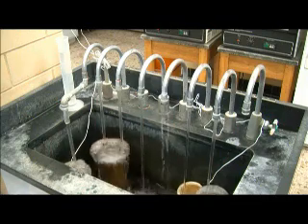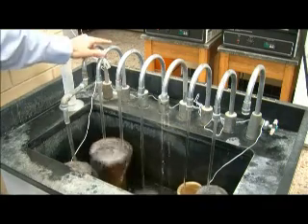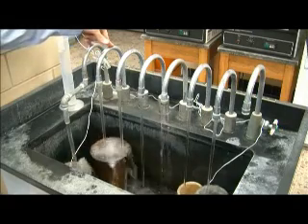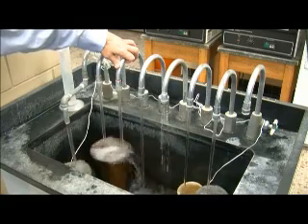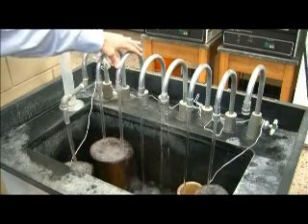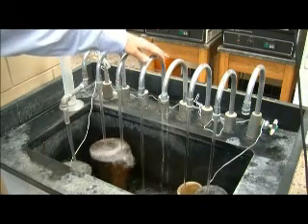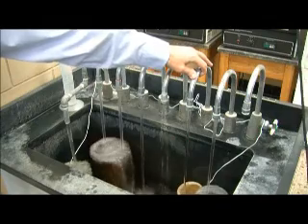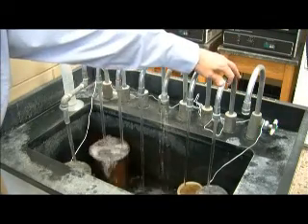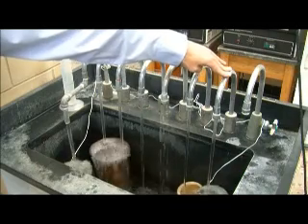We'll move right along. We're taking a look now at the sampling sink that we use to monitor all phases of the water treatment process. As you can see, these 2 are actually raw water at our intakes and at the wells, coming right out of the lake. This is right after we've added all the chemicals in what's called our flash mix. This is water that is just entering the filters prior to the filtration process. This is the combined effluent after we have filtered all the water, and this is a tap sample, which is actually out on Lincoln Avenue to mimic a tap that is just like in someone's home.